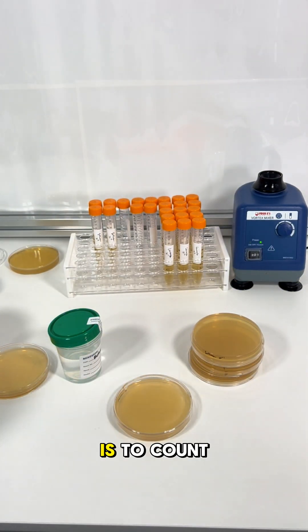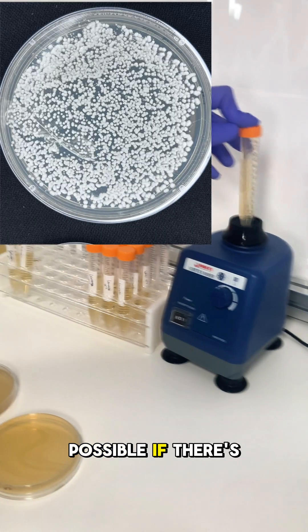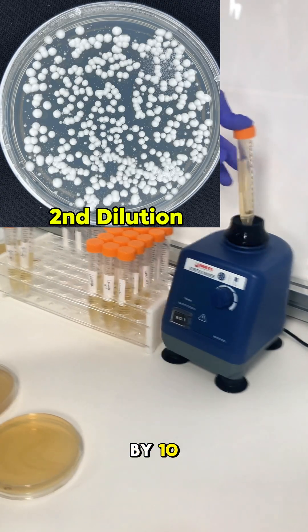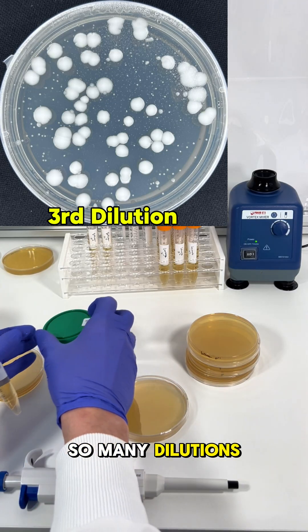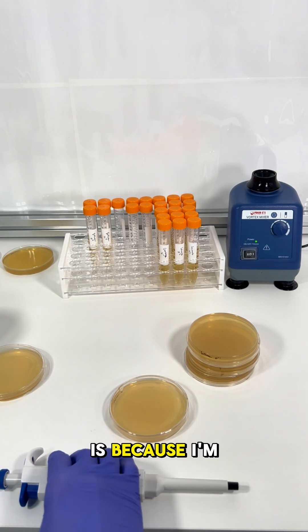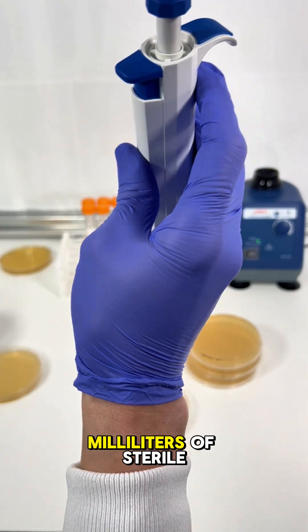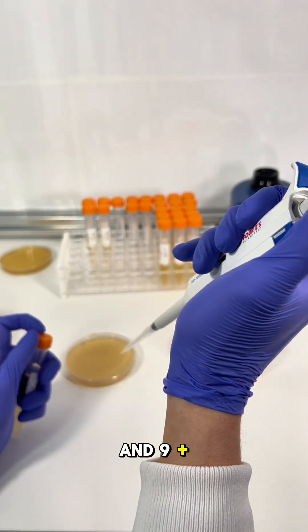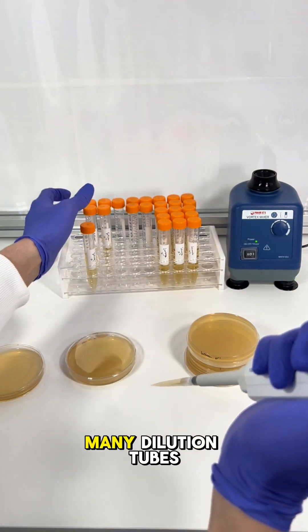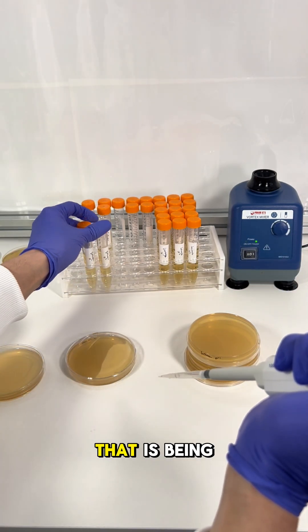The end goal of this entire process is to count the total number of bacteria colonies, but sometimes this isn't possible if there's too much growth. The purpose of a dilution tube is to divide the total amount of bacteria by 10, so that after enough dilutions it becomes possible to count colonies. This works because I'm adding one milliliter of water into a tube containing nine milliliters of sterile tryptic soy broth — nine plus one gives us the 10 we divide by. The number of dilution tubes needed depends on how contaminated you expect the water to be.